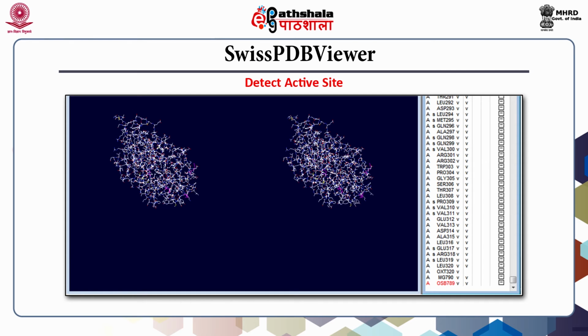Press the shift key and click in the first column of the control panel to mark all residue backbones as visible. Again press the shift key and click in the second column to display the side chains. Again press the shift key and click in the fifth column of the control panel to hide ribbons, that is, to mark all ribbons as invisible.